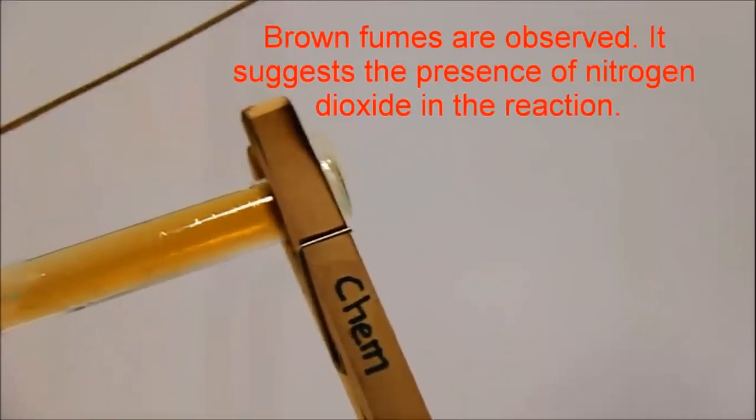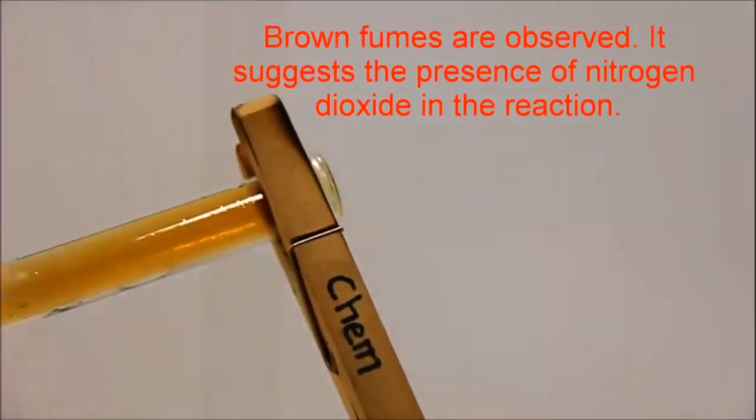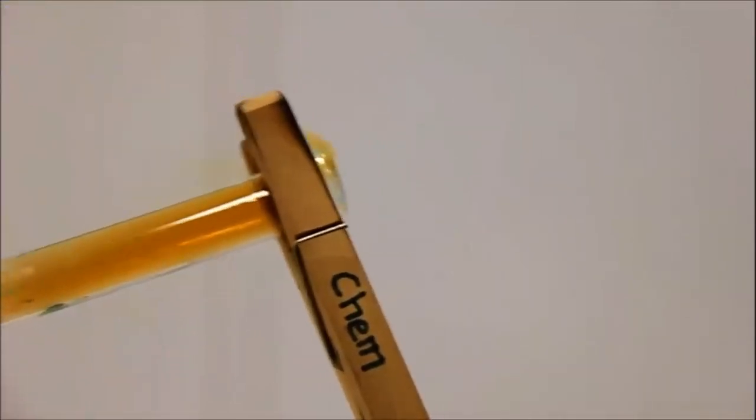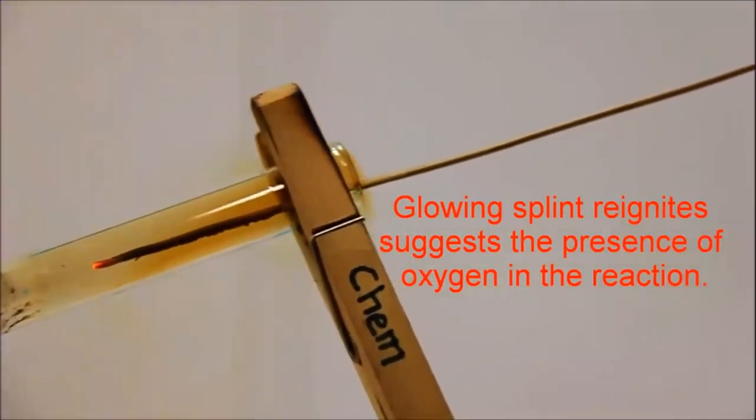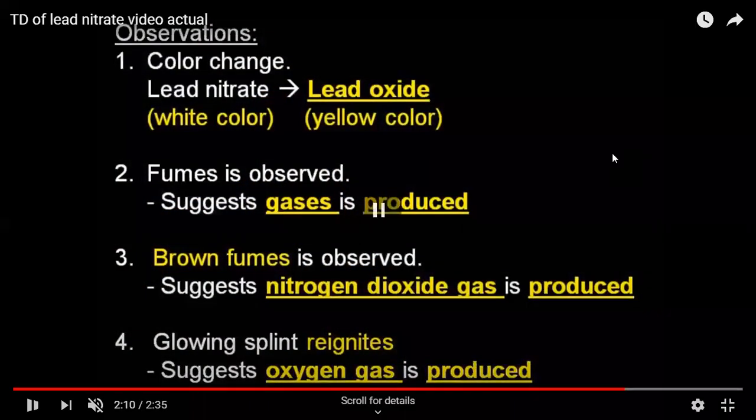So how many byproducts are formed, from the observations? We can say that there are three byproducts. One is yellow lead oxide, second is brown fumes of nitrogen dioxide, and third is oxygen, which can be justified with the help of the glowing splint reigniting. Now you can observe this lead nitrate. Initially it is white in color. After the reaction, lead oxide is formed, which is yellow in color. After that, you'll see some fumes being observed from the test tube. These fumes are of nitrogen dioxide gas. And at the end, you can see one more observation, that the glowing splint reignites, which shows that oxygen gas is produced in the reaction.